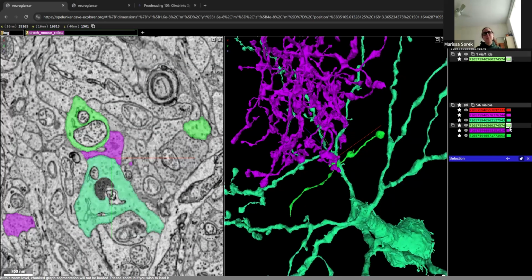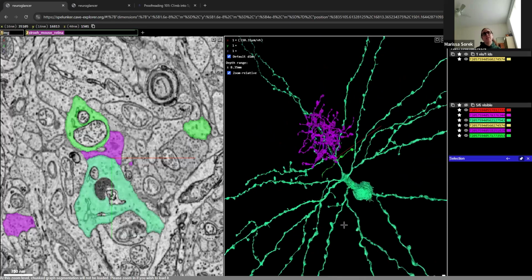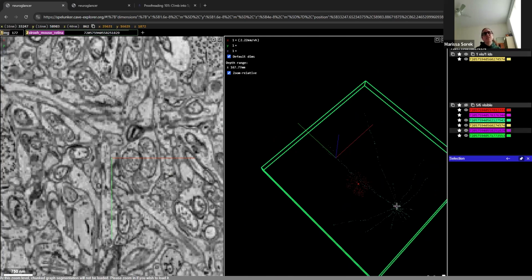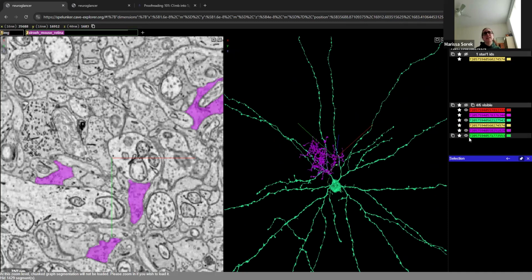So I like to tell people, if you want to remove this custom set color, let's say we no longer need it to be that set lime green color here, I just right click it and it goes back to being its own color. And because we were looking at the change here, it's just because we have the old segment ID up here. So let me just hide that now.